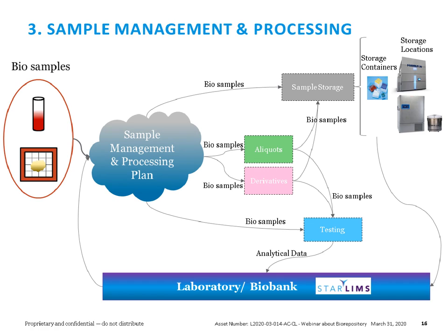They just came, and now there needs to be a whole different workflow or workflows that these samples have to be routed depending on different conditions, perhaps clinical studies that dictate the sample management and processing plan, or sometimes we could have a laboratory that is just very simple. This is the sample management and processing plan for all our samples, regardless of clinical study. Or perhaps you may want to even do this based on sometimes the test that was ordered, etc.